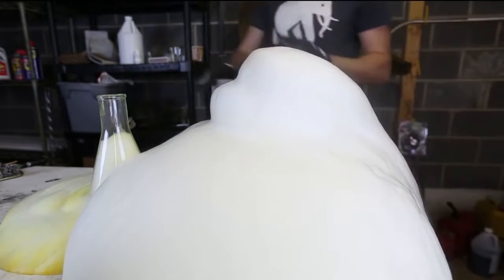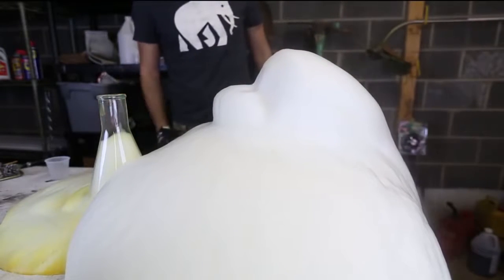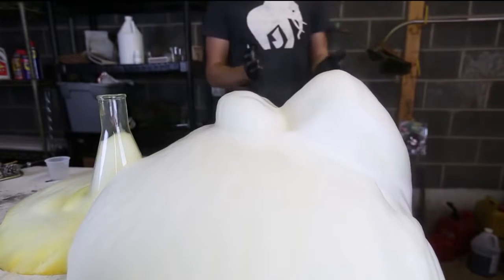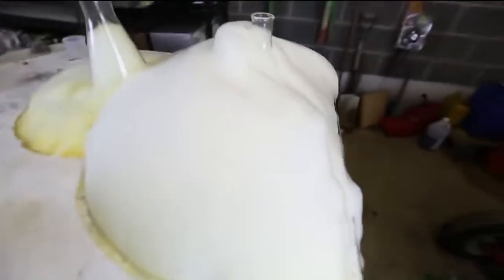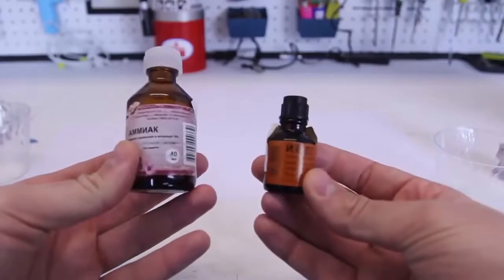That was way cooler than this one. What do you guys think? I just needed a little bit more potassium iodide. This is insane. Boom! Look how much foam. Thumbs up for this experiment for sure. So this is what I'm gonna use.